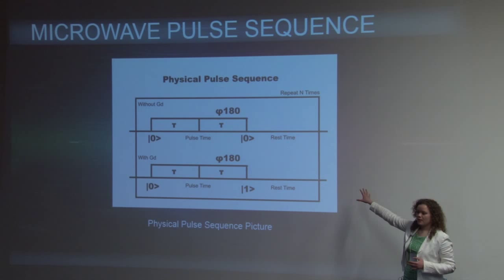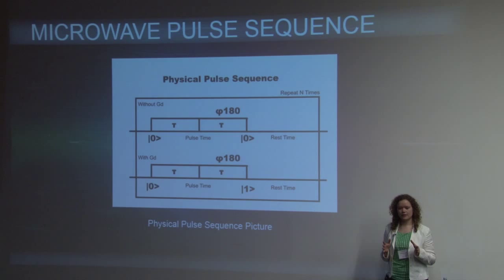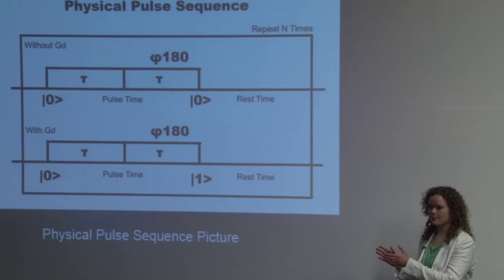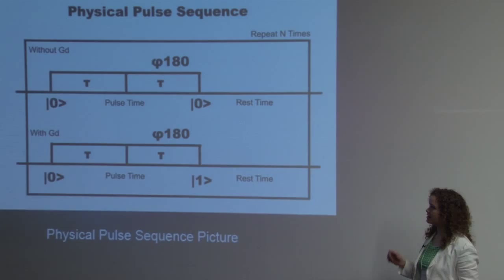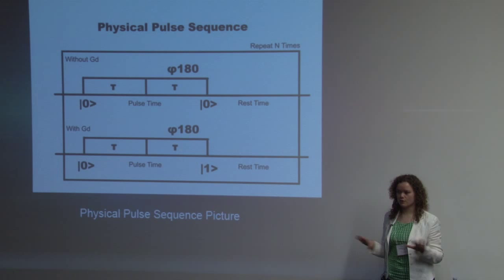So this is our experiment. Essentially, as I mentioned, we're sending in a microwave pulse, and then we're waiting a certain amount of rest time, and we repeat this many, many times. While we're repeating this, our photo detector is collecting the light coming from our diamond. The end result that we're looking for is that when there are no magnetic particles close to the surface, we should not see a change in the intensity that we're picking up. If there are magnetic particles close to the surface, we should see some sort of change. Furthermore, we should be able to differentiate whether the particles are close to the surface, free-floating, or no particles at all.